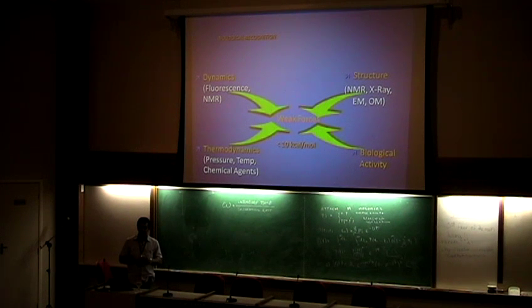And another thing that is important, especially because you also hear Felix, a lot of the photophysics was worked out 20, 30 years ago. There are a lot of possibilities there. More recently we had the development of multi-photon spectroscopy, but still there are a lot of possibilities. All the photophysics that I mentioned for single photon spectroscopy changes for two photon spectroscopy. And then I'm sure that André will also take care of that.